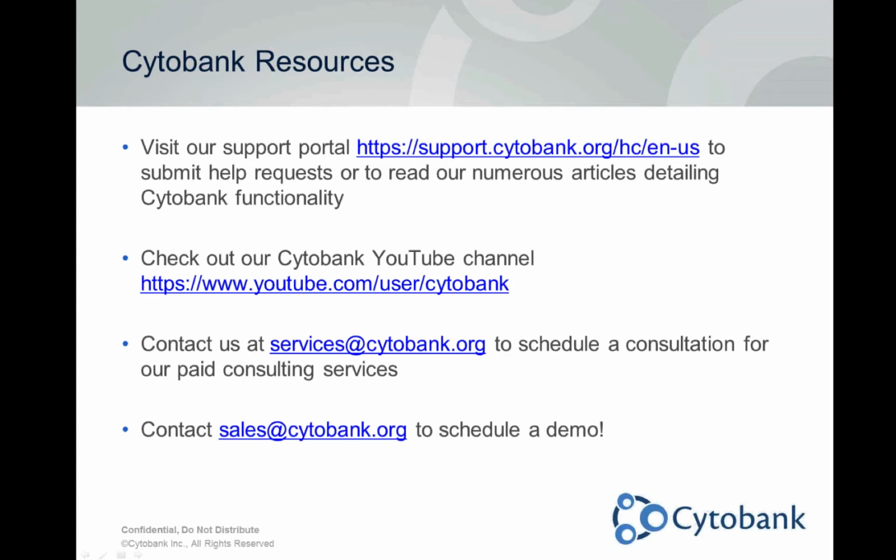Cool. So next one here, Peter asks, you mentioned Cytobank has normalization as part of Citrus. Does that help with batch effects? That is a great question. So the normalization that is built into Citrus is intended to help with differences in the expression of markers in different channels.